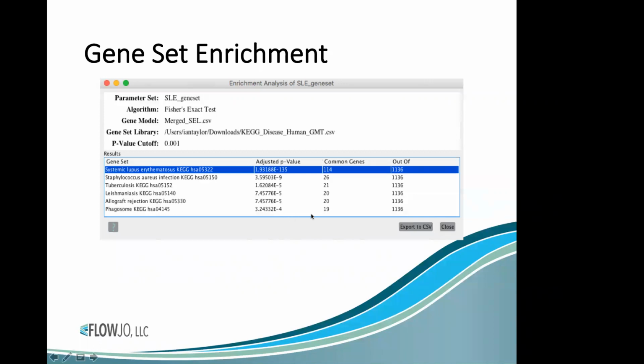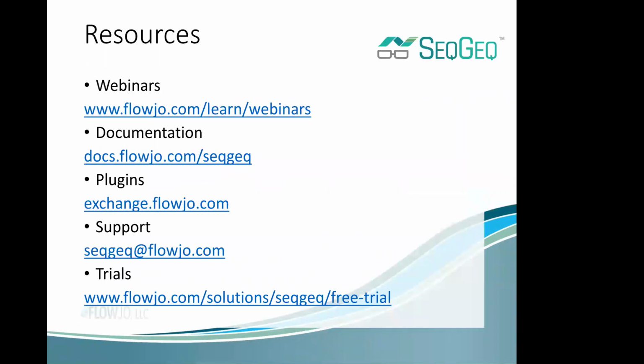So we're trusting that the gene set enrichment analysis is working correctly, and it's pointing to something significant. Now, this may not be a part of your discovery workflow. This would be more of, again, a validation step. But if you had pathways that you were interested in exploring within the lupus disease state, you could run a gene set enrichment analysis specifically for pathway enumeration and further discovery. And that's about all the slides I have on gene set enrichment analysis.